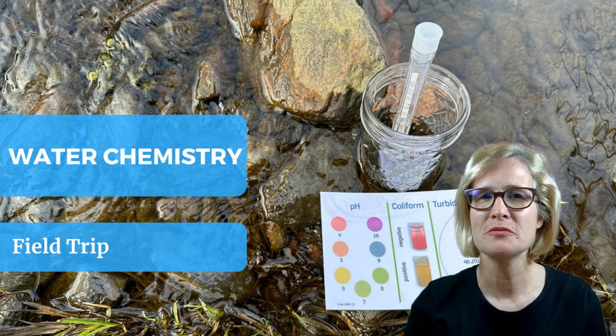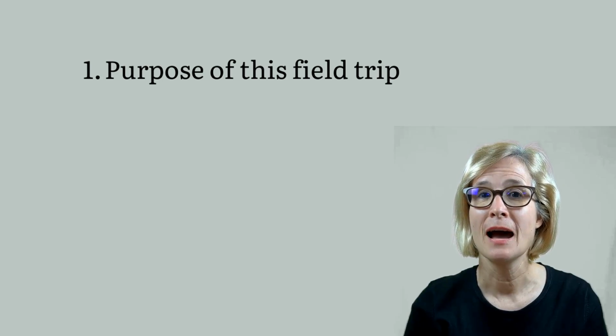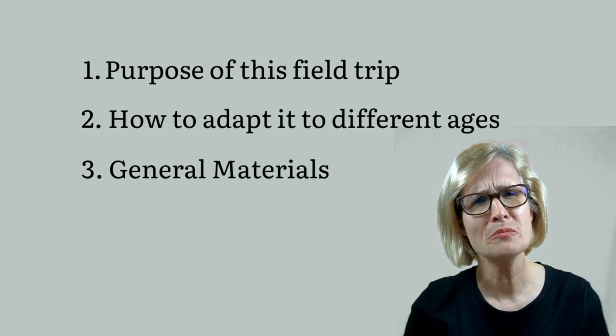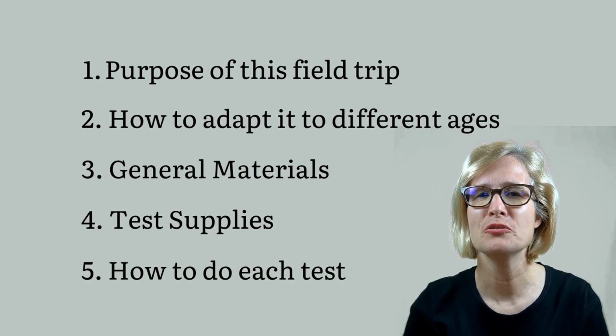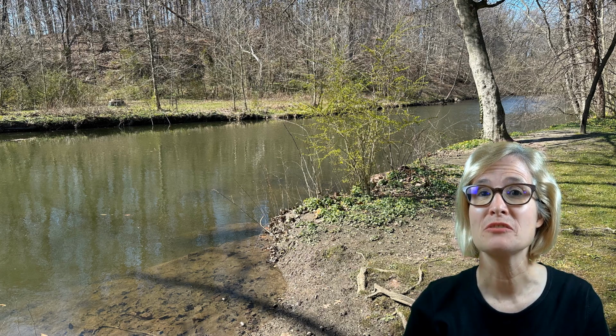Welcome! In this video, I will explain the purpose of this field trip, how to adapt it to different ages of children, what general materials to gather, the test supplies that you might want to order, and then finally, how to do each test.